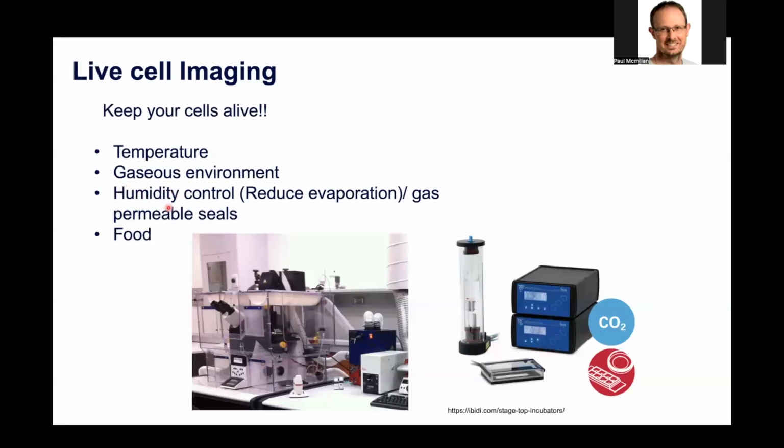Humidity is also another important thing. So we want the media that the samples are sitting in to remain. So anything that we're flowing on, in this case CO2, needs to go through a little bubbler system. There's a zoomed in view here. Anything that we're blowing on top of the samples on the stage here is actually humidified, so stopping any evaporation.